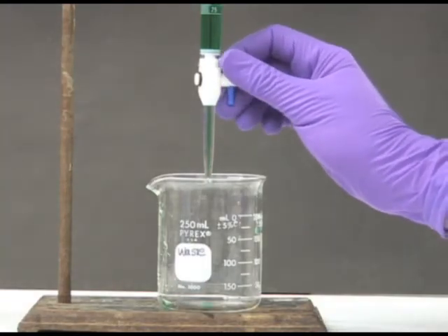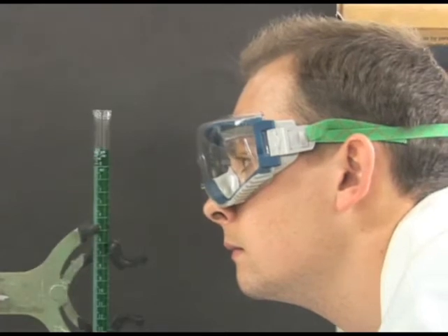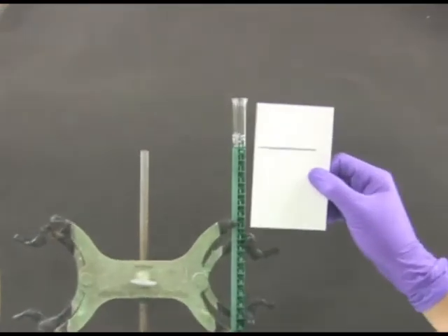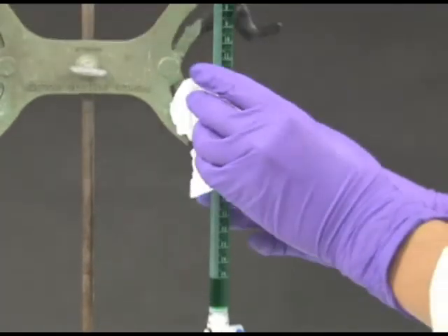Turn the stopcock to drain the burett until the solution is at the 0.00 line using a white card with a black line to read the burett. Always read the burett at eye level for an accurate read. Make sure no solution drains down the side of the burett.